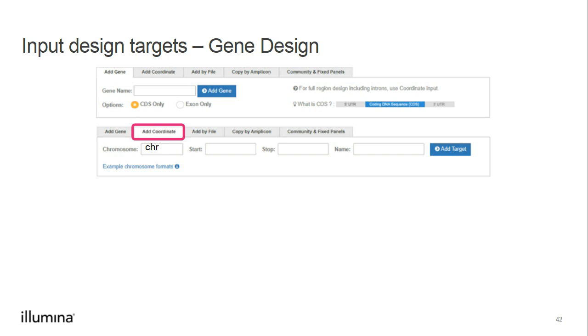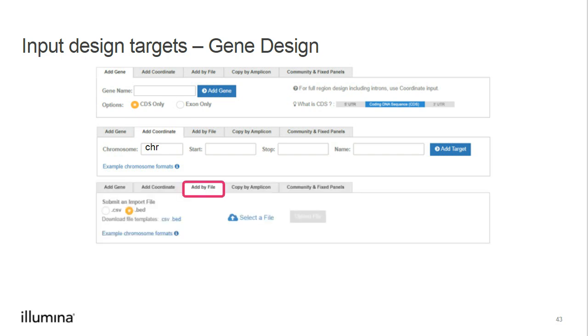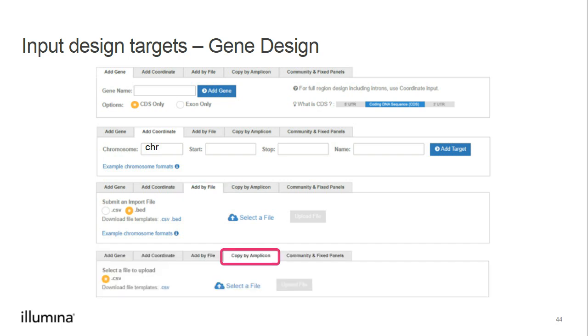You can also upload a file. For larger designs, you may want to download the template, enter all of your input, and then upload that file to add all the targets at once. You can see here there's the option to download the template and then upload it back into the system. The Copy by Amplicon feature allows you to copy existing Amplicons either from a previous design or from a community design. Again, you can download a template, modify, and then upload the file. Be sure that when you're uploading this file that you've included the Amplicon ID and the solution ID that's required in the template.